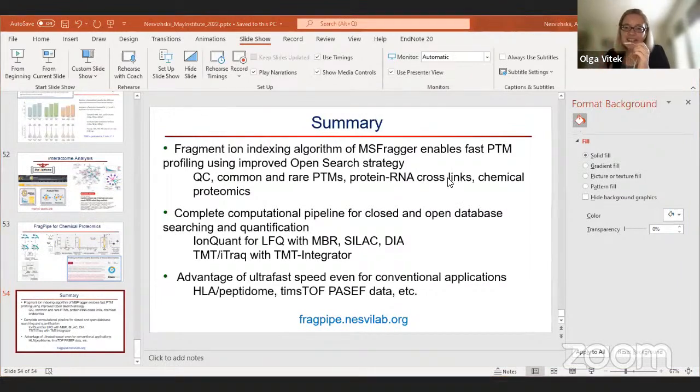So maybe talk about PTM identification with MSFragger, DIA, and DIA-NN. And for example, deamidation, if you can comment. Deamidation. So with what quantification workflow? We support DIA, TMT, label-free, all of that, right? MSFragger is just a search engine that will identify the phosphopeptides. Then how you generate the reports: if it's label-free, we have site level reports that are generated by IonQuant.